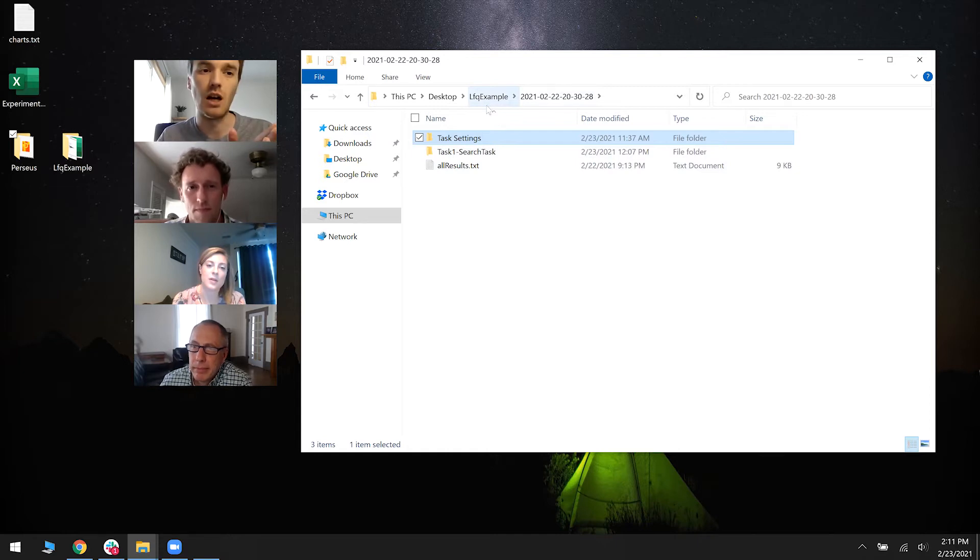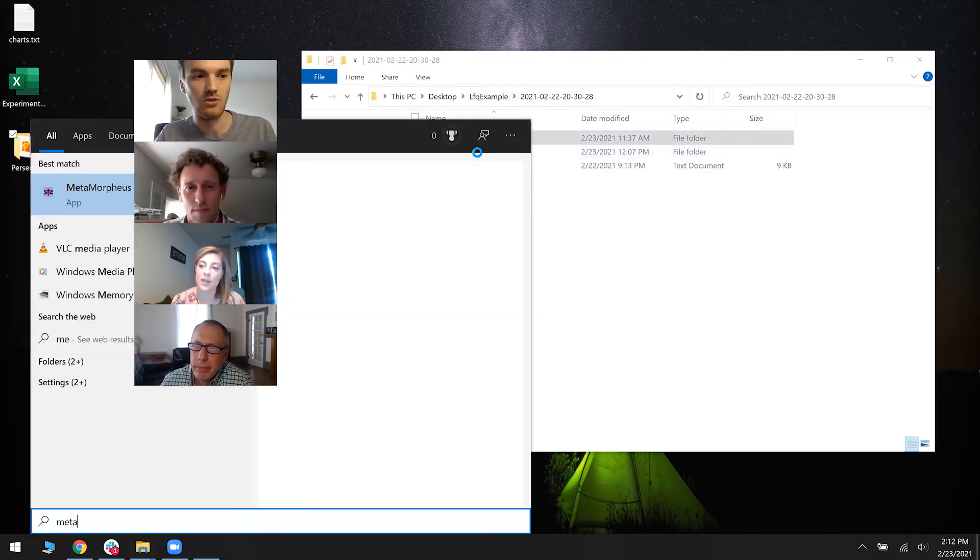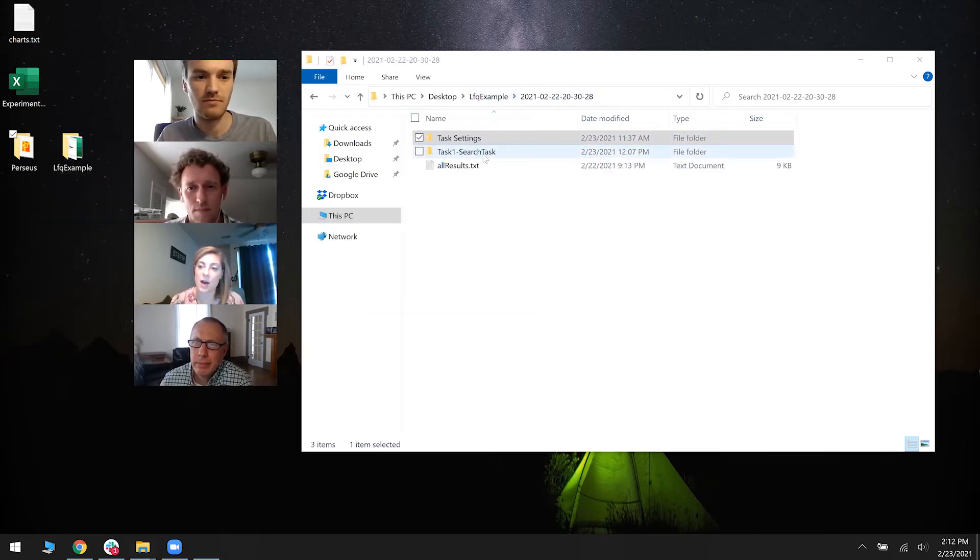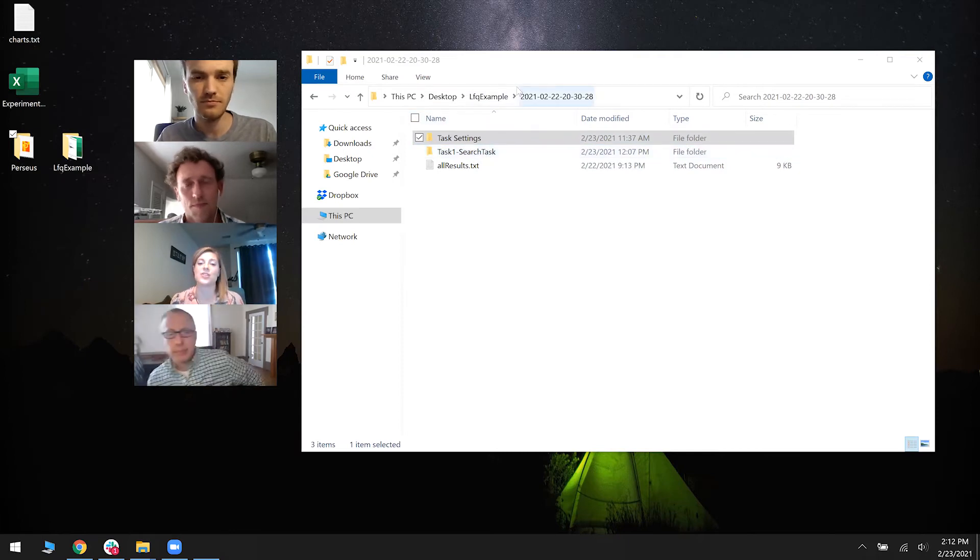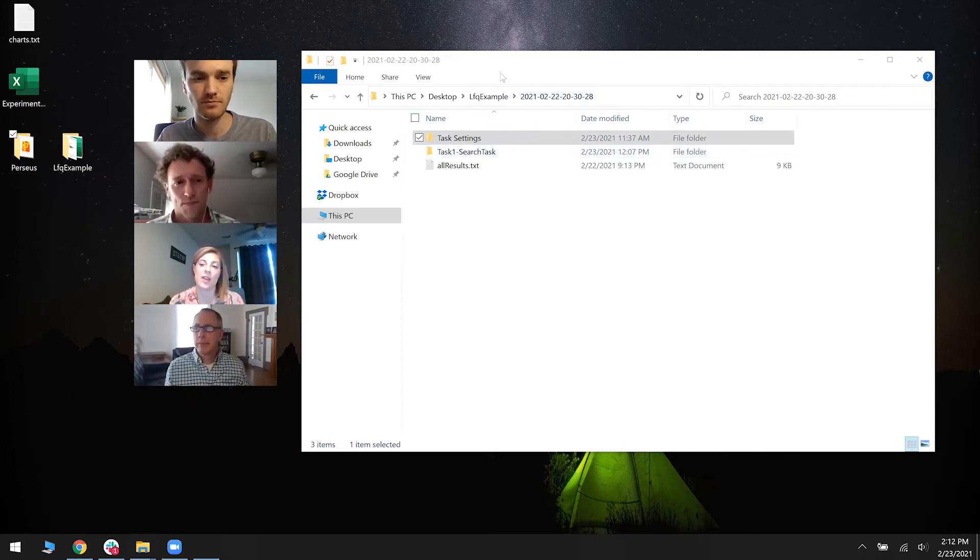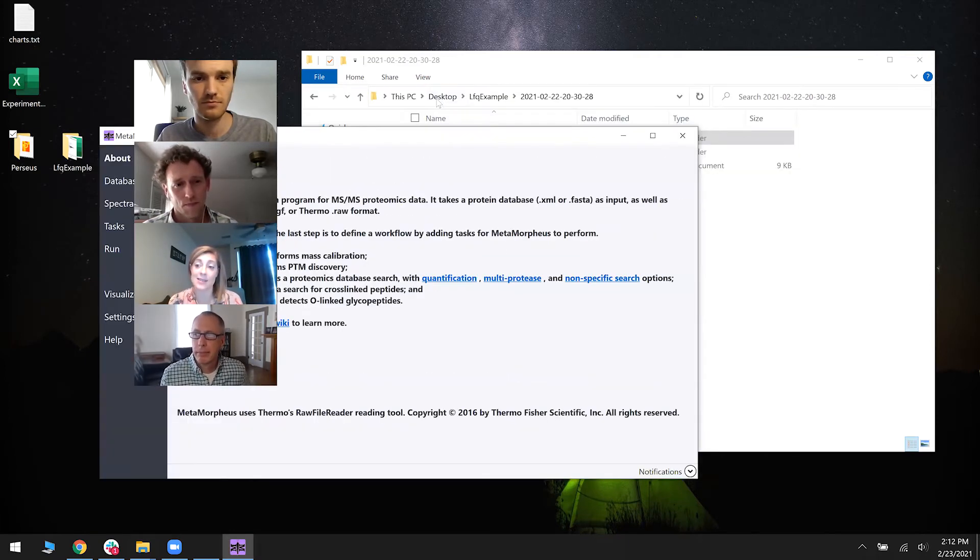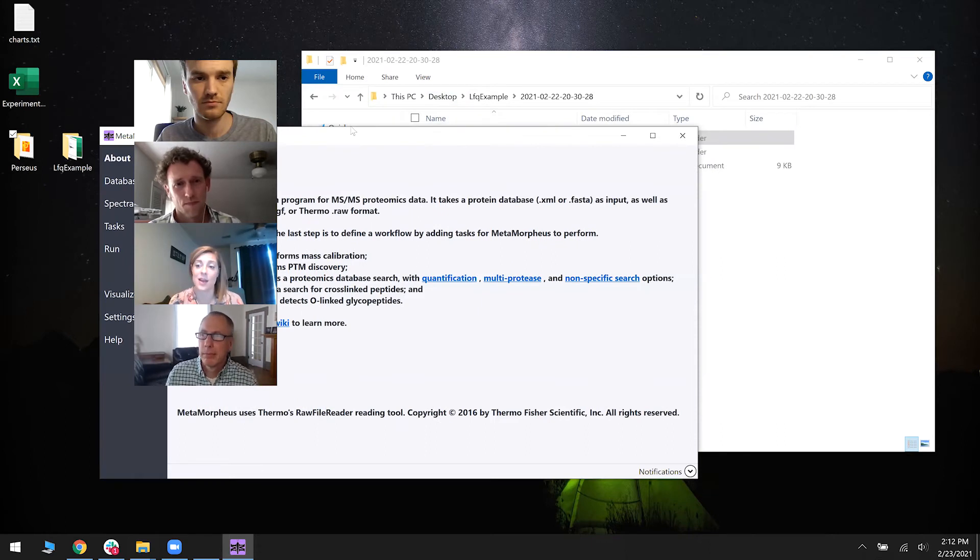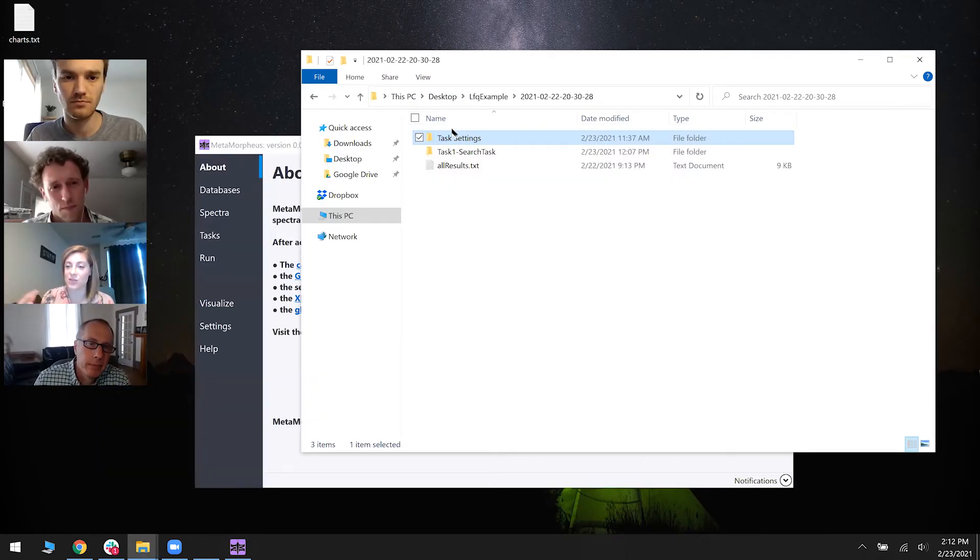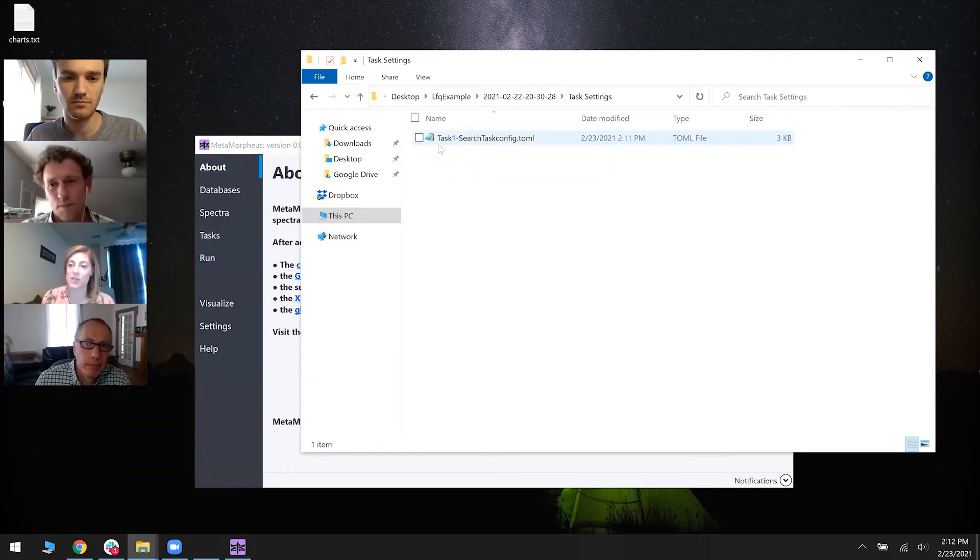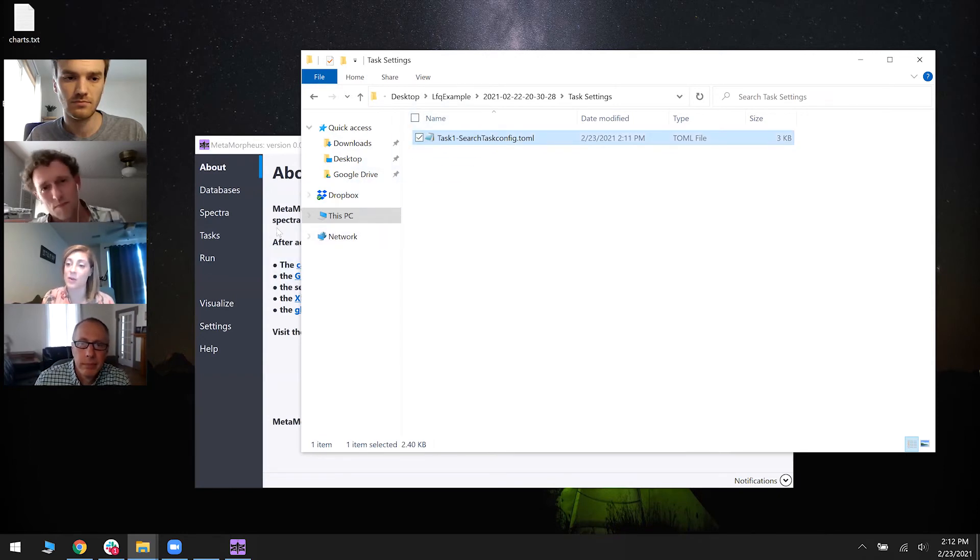You can just drag and drop. That creates a task. Yeah, the TOML files for each search task are created once you say add task and you start the run, then it saves those. So all the parameters that you set in the GUI are then saved to that TOML file.